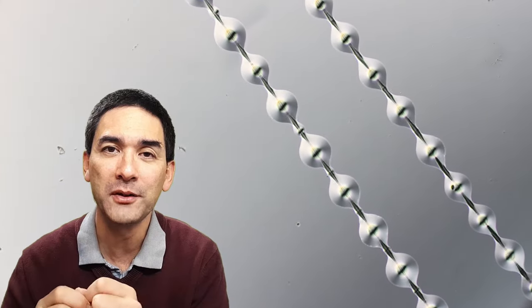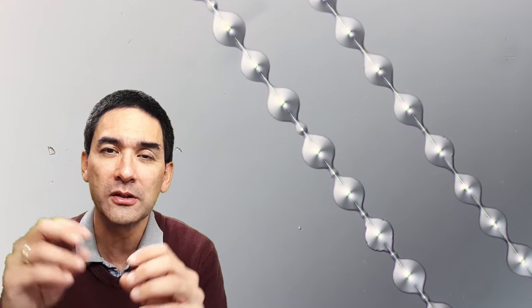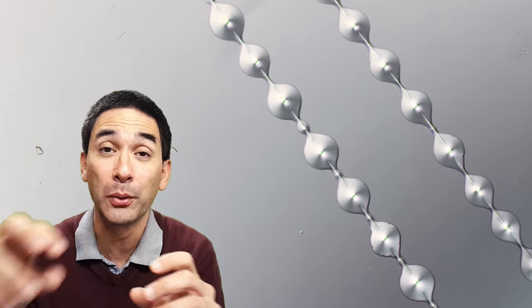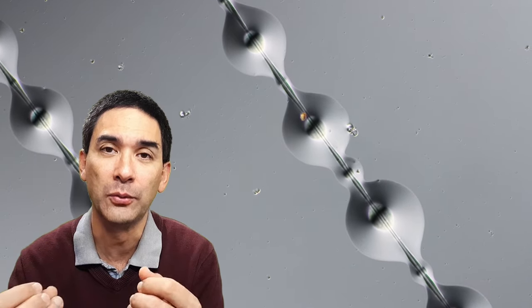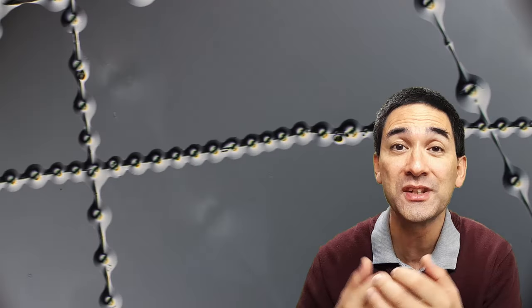The spider's web under the microscope looks very regular. It's almost like a necklace with pearls on it and those pearls that you see are actually the droplets of glue. Right now the glue connected with the microscope glass slide and that's why it's not quite perfectly round but slightly oval in shape because the glue also spread on the microscope slide, illustrating a little bit how sticky it is.